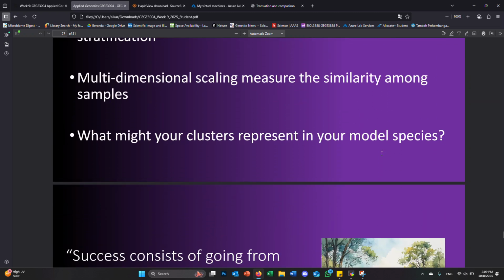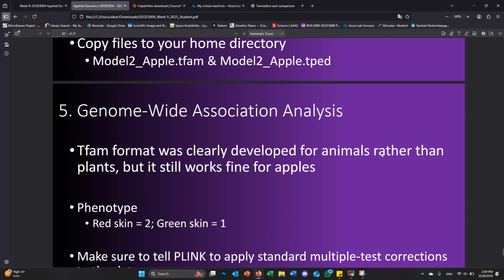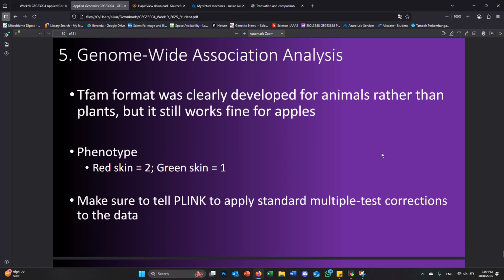in Excel. It's just the easiest thing to do with this. All right. Now, just like earlier when you were creating a Manhattan plot, a Manhattan plot is just a visual representation of your results from a genome-wide association analysis, right? It can be done in HaploView, it can be done in Excel, it can also be done in R and other programs. We just happen to be using HaploView.